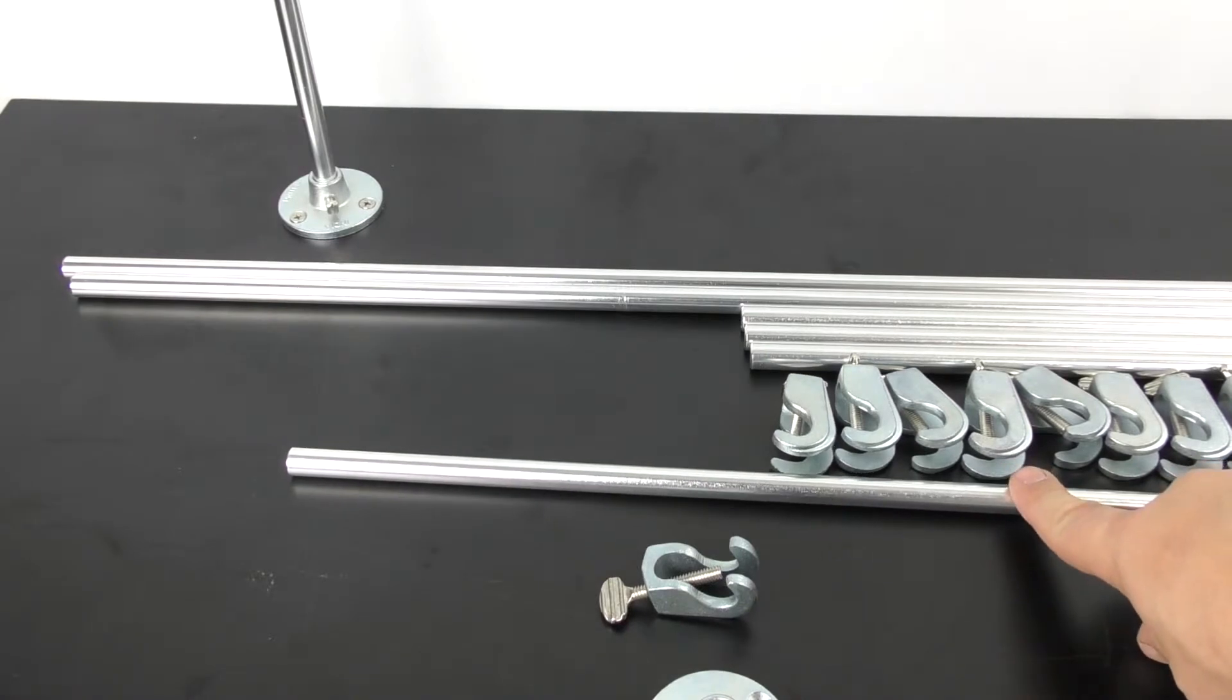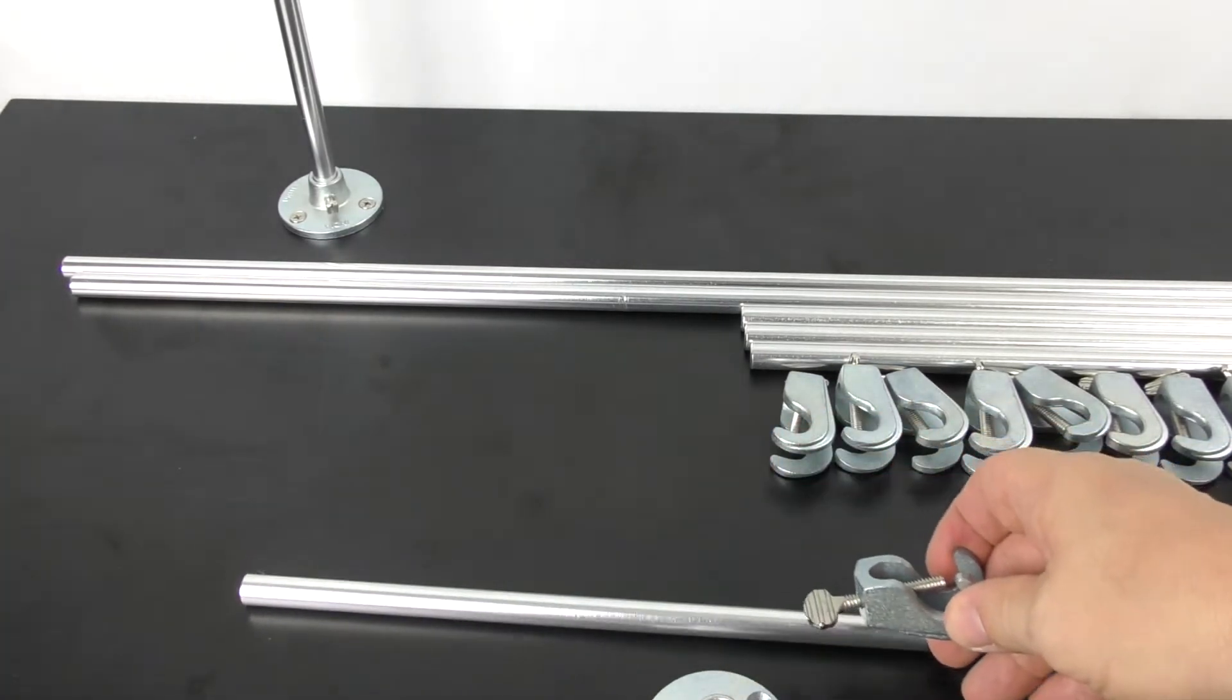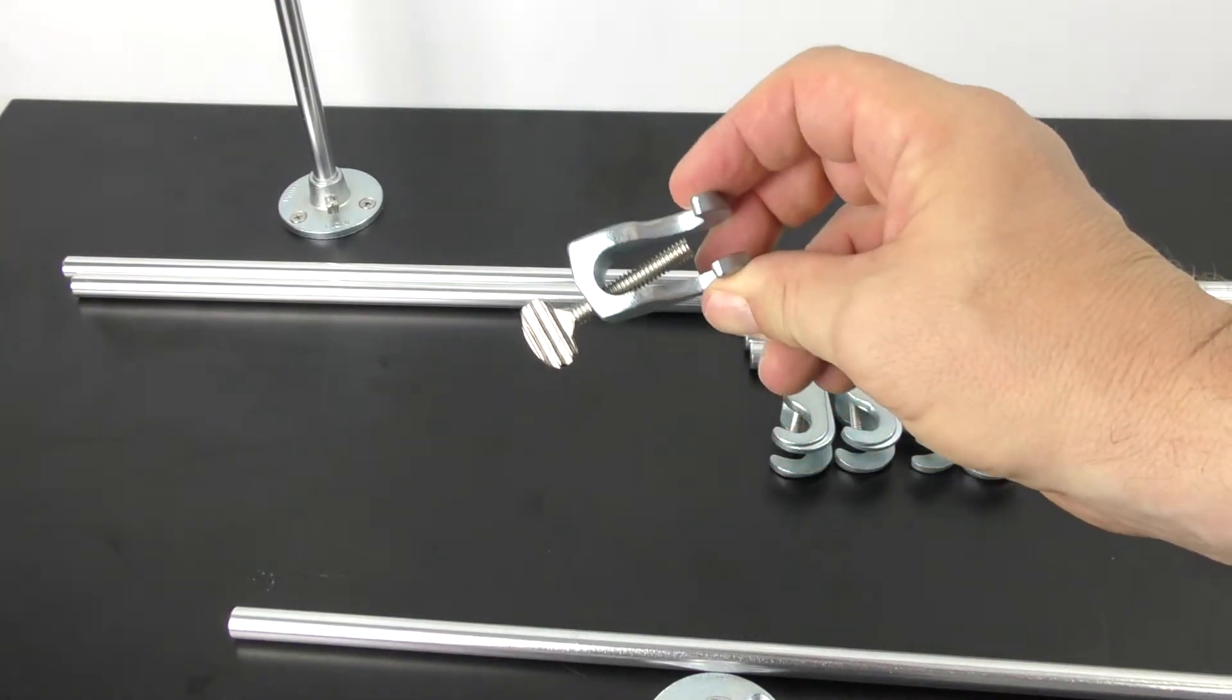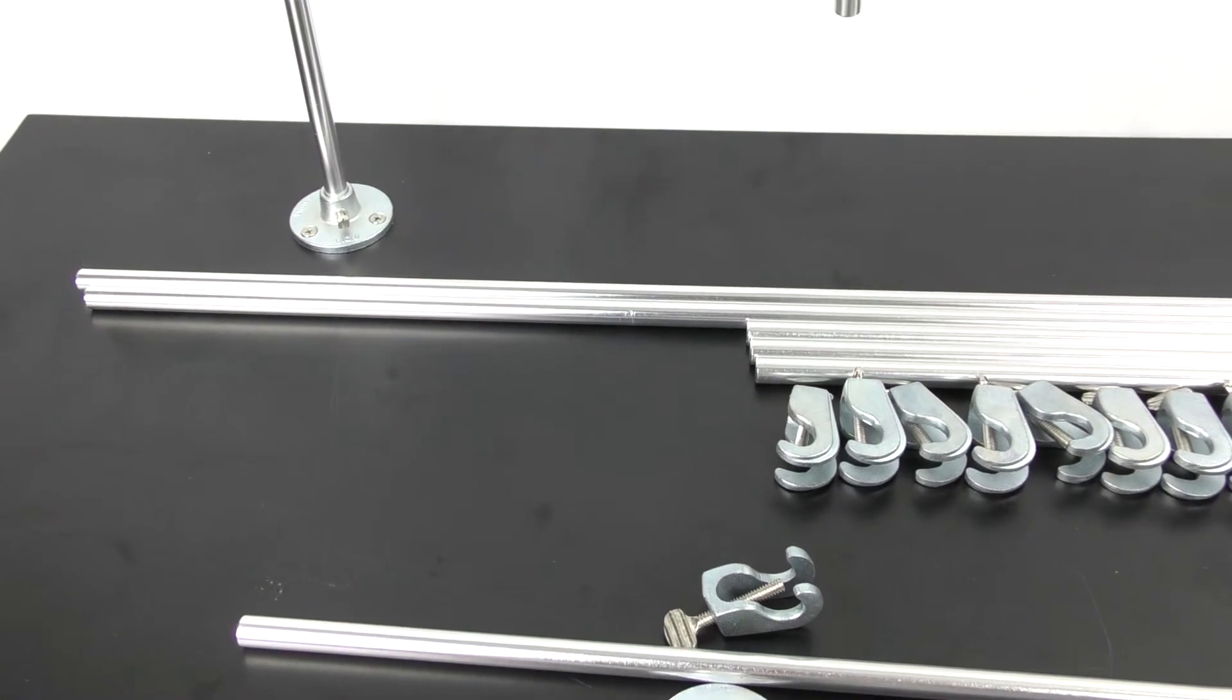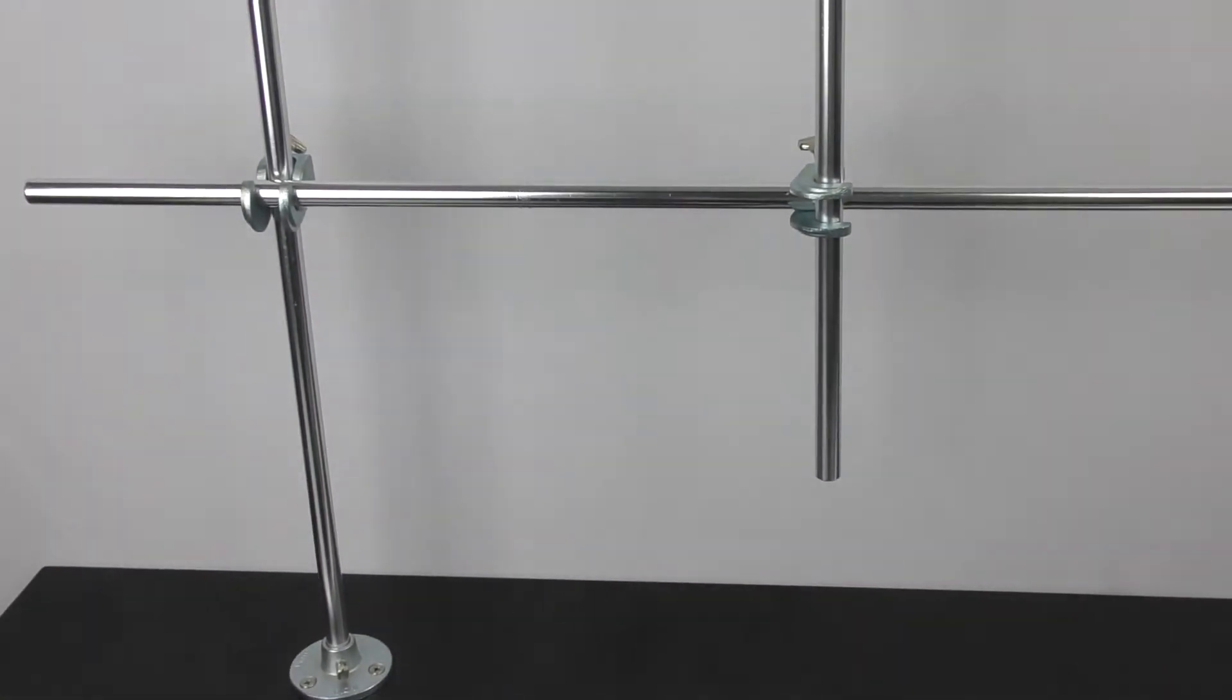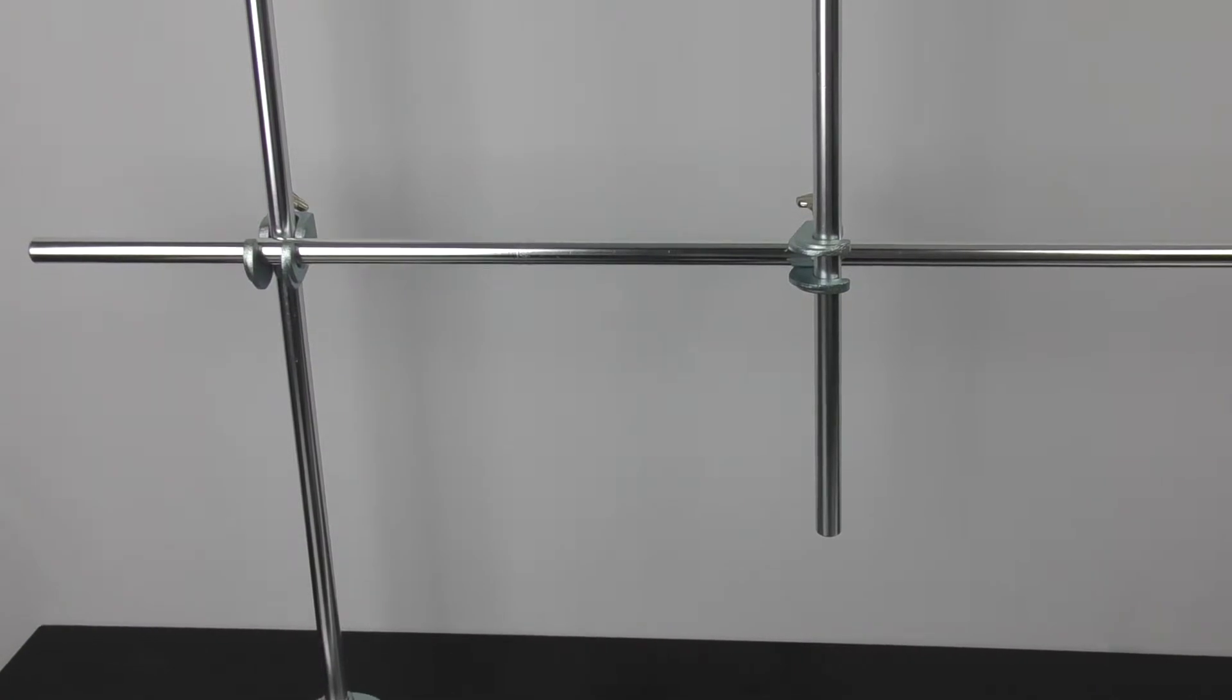There's also a variety of rod styles and sizes, and the most important piece is the connecting clamp. With this connecting clamp, you can connect these at right angles and they slide around to give you any configuration that you could want.